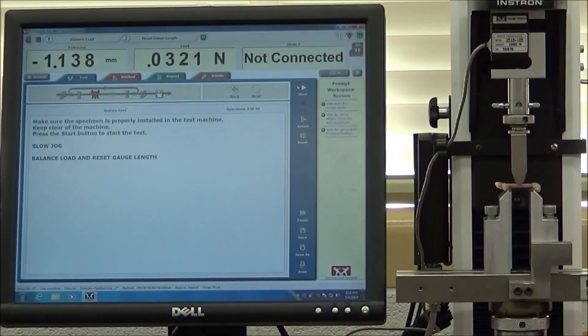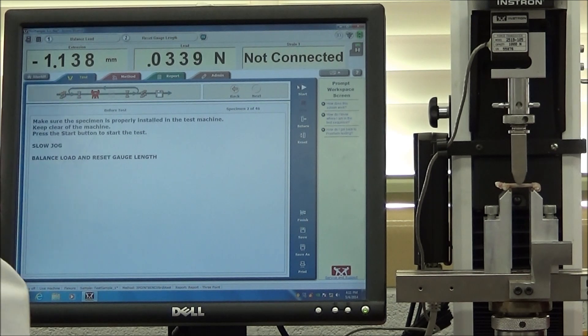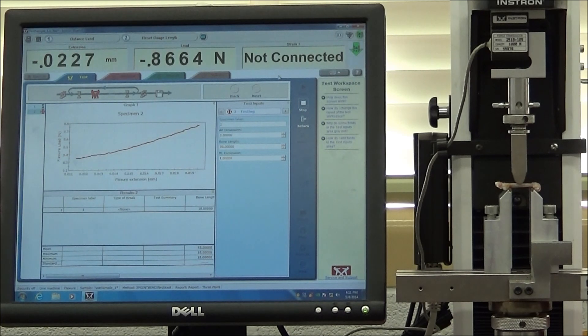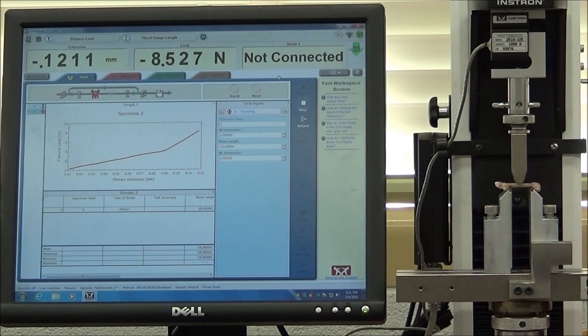I want you to take note of the shape of the force displacement curve that you're going to get here. You're going to notice that it's going to look a lot like the stress strain shapes that we've learned about in our books. I'll tell you a little bit about transforming those force displacements to stress strains after the test. With our preload, we'll balance our load so we start at zero. We'll balance our gauge length so we start at zero. There's a little bit of noise in the beginning. It bumps and bounces around a little bit, but you see that this is the elastic portion of our curve, which means if you stop the test now, the bone would theoretically go back to its original shape with no permanent deformation. We see a little toe here. This is pretty normal in the rat bone, but still we're in our elastic region.